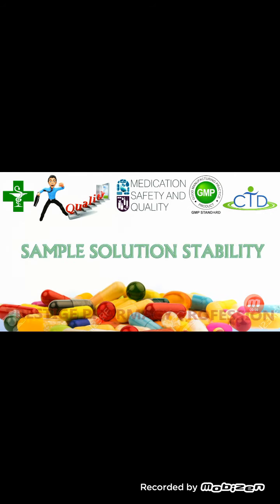Sample solution stability is also one of the important parameters for method validation, because mostly, a validation method requires 24 hours or a long time period for getting full results on HPLC, and during this period, your analyte solution shall remain stable.